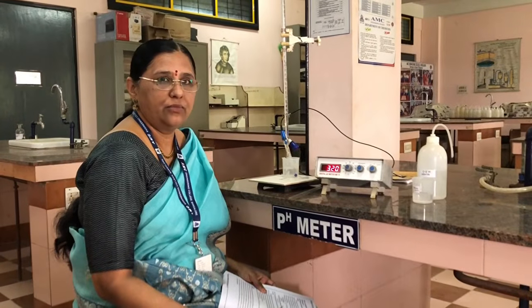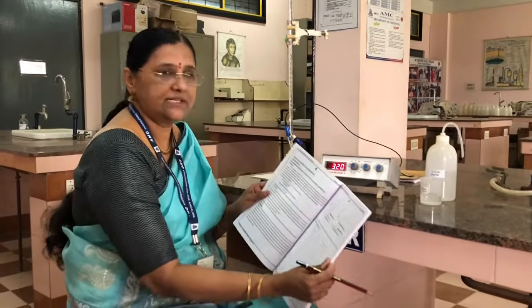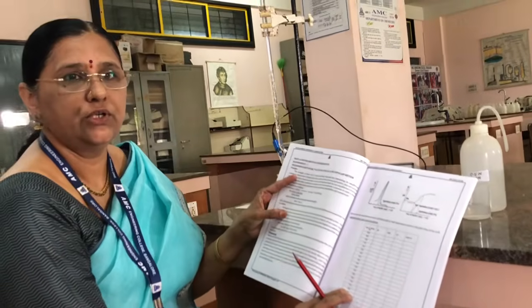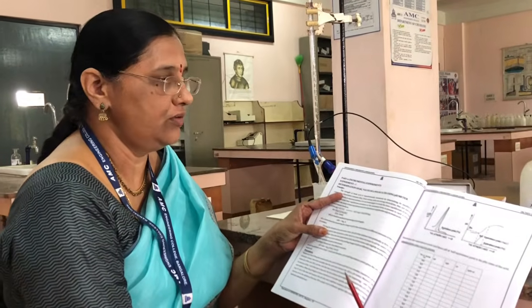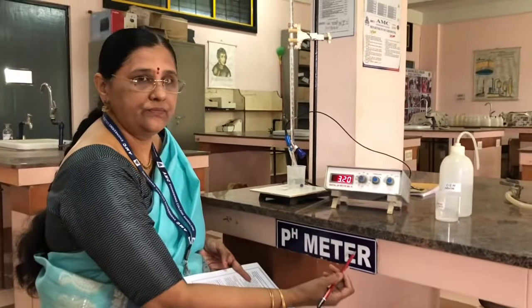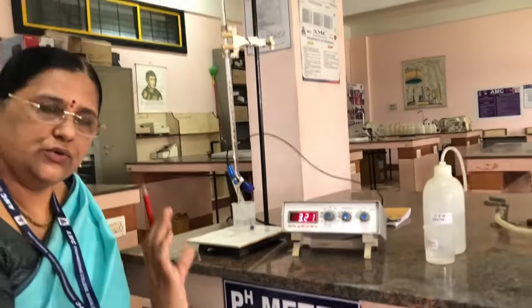Today we are going to demonstrate the instrumentation experiments which you have not done. So today we will be starting the first experiment. If you open your manual book, you will come to know. The first experiment is determination of pKa value of weak acid using pH meter. So we are using the pH meter and we have to determine the pKa value of the given weak acid.